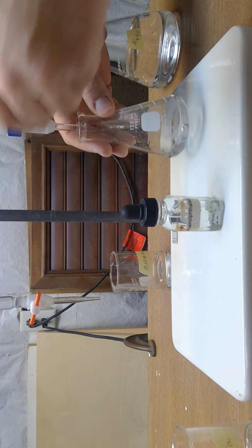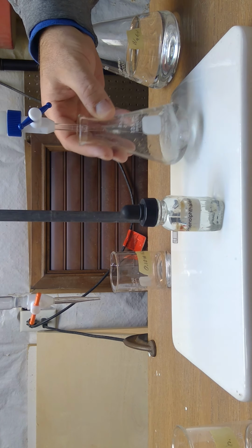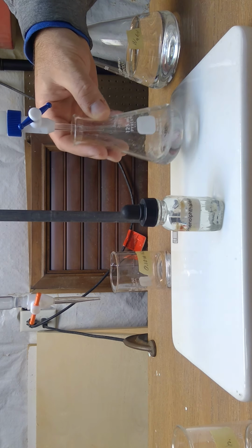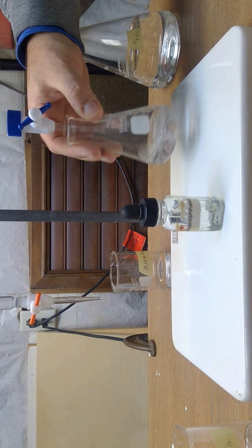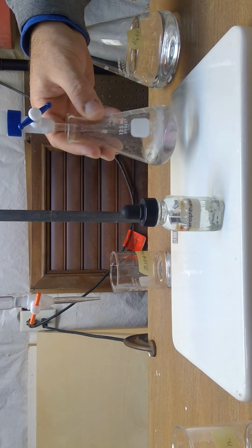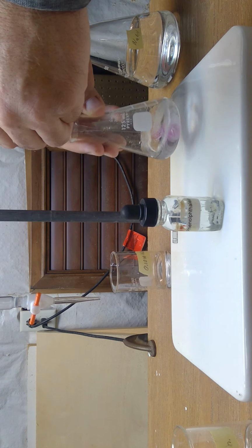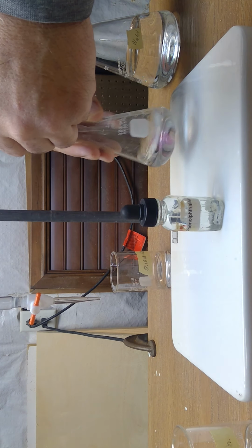All right, so I'm going to go fast to start, because as you get closer and closer to your end point or your equivalence point, the pink stays longer and longer. Right now it's reacting very fast. Now, as it starts to stay longer, I'm going to slow it down. So you can see it's starting to stay longer already. So I'm going to slow down.